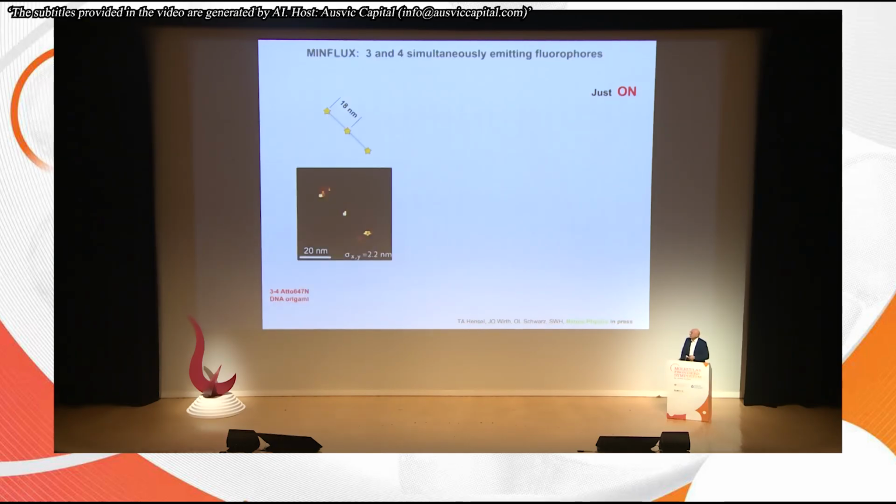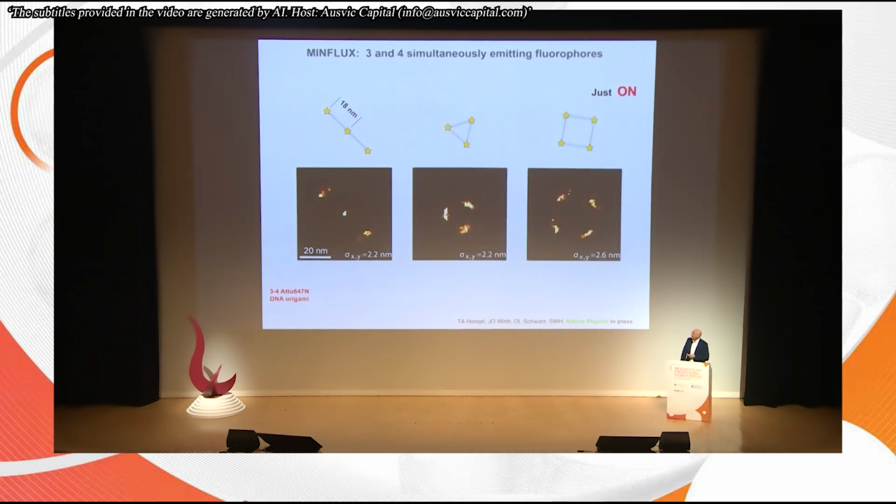So why is this important? Not only because they separate 2, you can also separate 3, also as it is shown in here, or even 4, and of course also in 3D. So it's not just the fact that you separate 2. It's a very general concept, as long as you are staying close to the minimum, so to speak, as long as you are at the true nanometer scale.